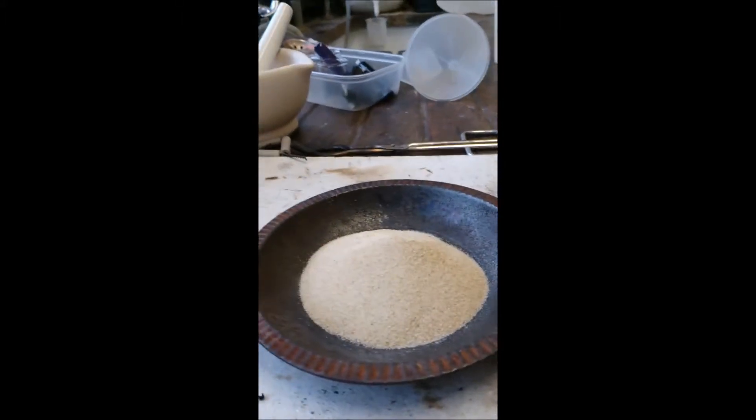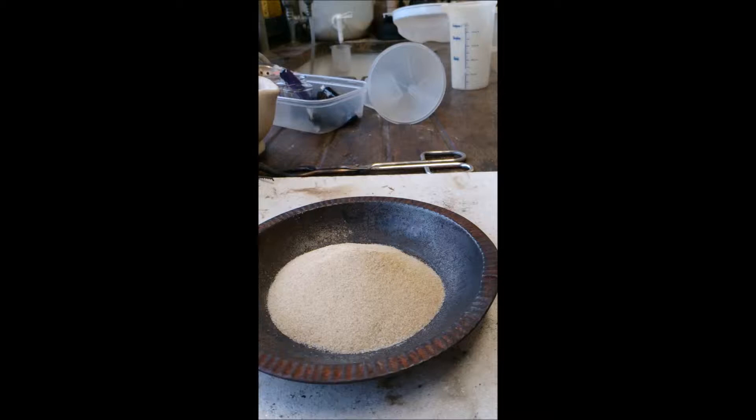Hey guys, I've got another practical for you. I thought it would be quite nice on Mondays to see if I can get a practical that you guys can try at home. So here we go, I'll give this one a go. It's called the Black Snake Experiment. You might well have seen it before but it's still quite a nice one to show.